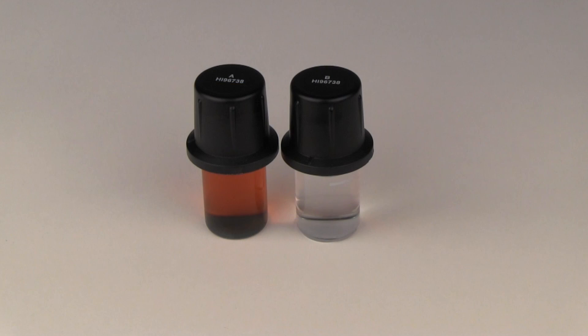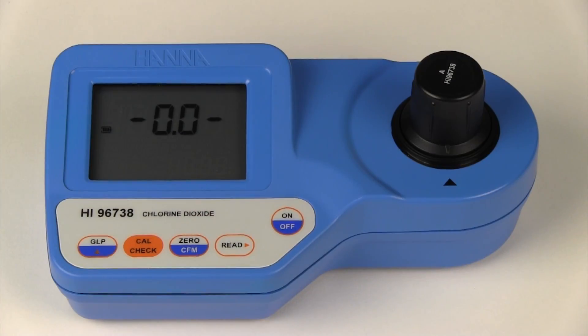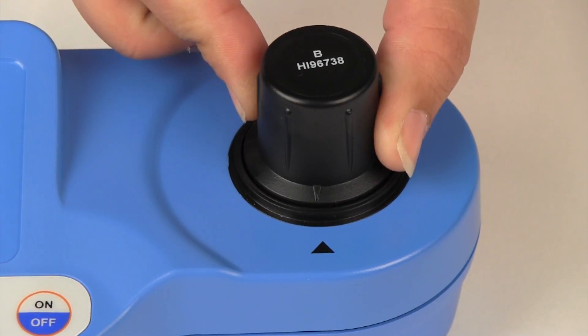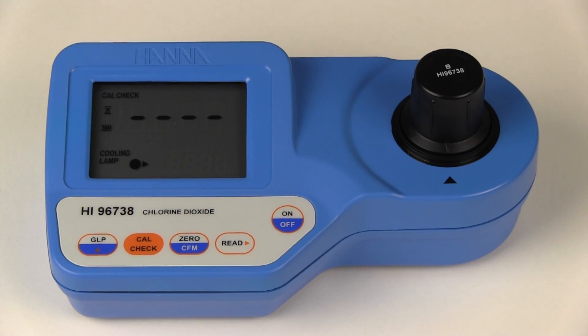Next we are going to read the one milligram per liter standard which has been cooled to 11.5 degrees Celsius. We will zero the meter. Wipe your standard of any dust or prints. Place the cuvette into the meter and index it. Press the cal check button to read the one milligram per liter standard. The cooled standard reads 0.85 milligrams per liter. This value is significantly lower than the expected value of one milligram per liter.